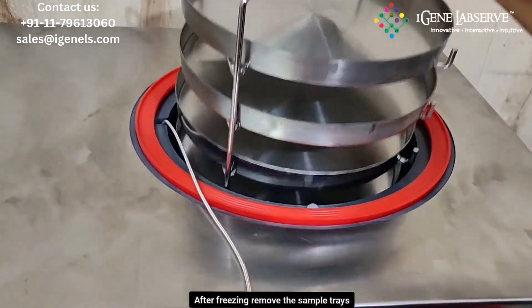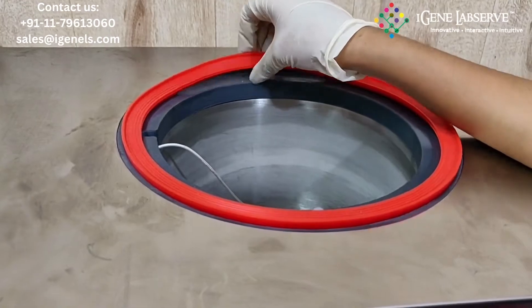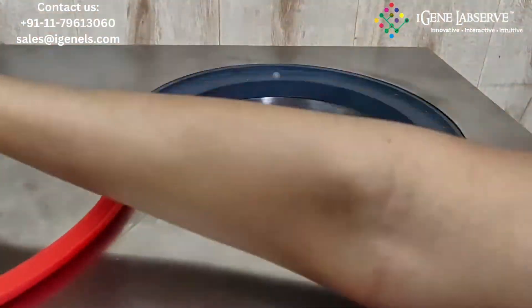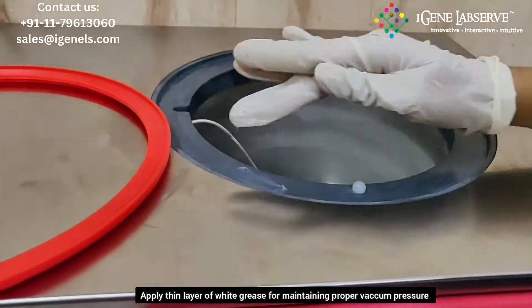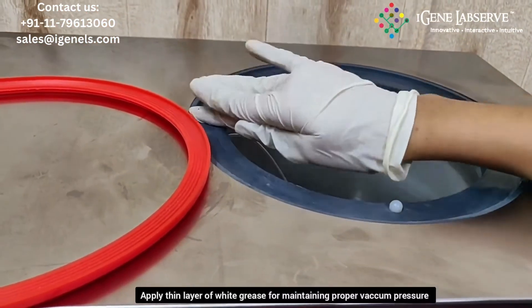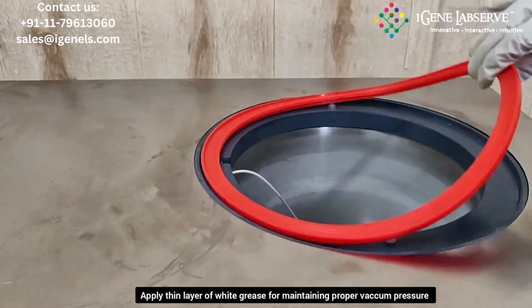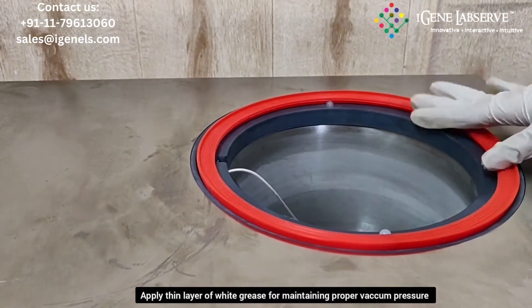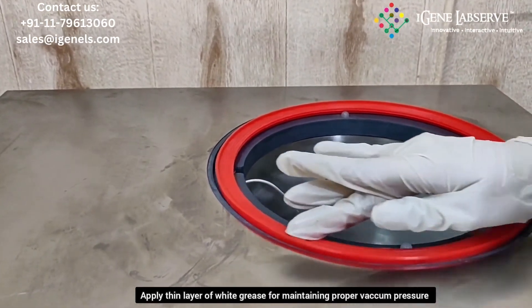After the freezing, you have to remove these trays. Now remove this ring and apply a thin, fine layer of grease over here for proper vacuum generation. Now place the ring on this, and you have to apply a fine layer of grease on this ring as well.